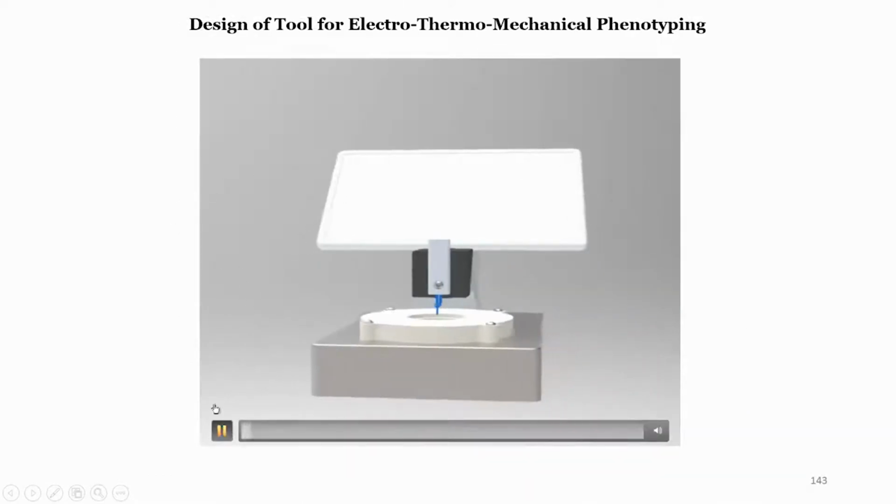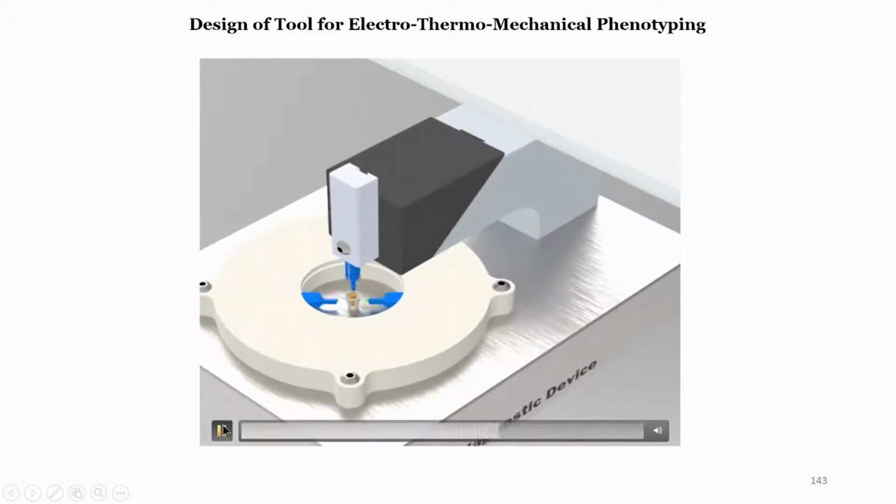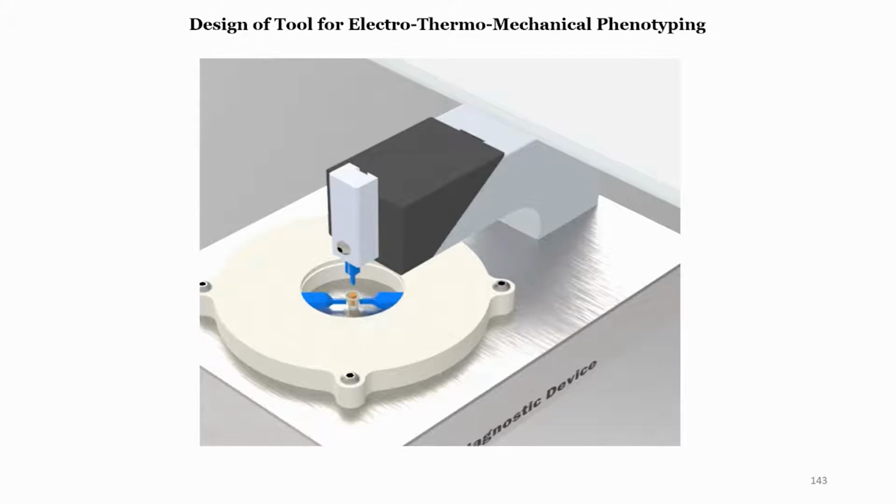So, what we mean is, you can see the video, and in this video what you can see is that there are indenters, right, and these indenters press against the tissue, and there is a third indenter also. So, once the tissue is there, you press it, and then you rotate the tissue, again you press it, and you press it from the top. So, you are covering most of the surface of the tissue, which is important, to cover more area of tissue, because tissue is anisotropic.